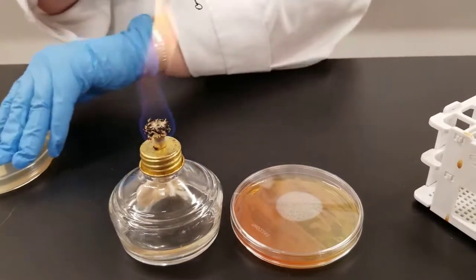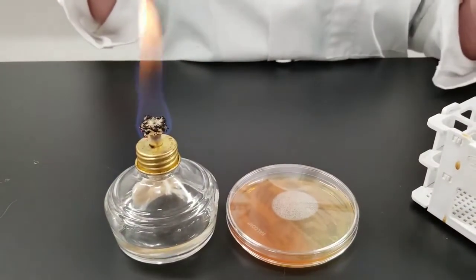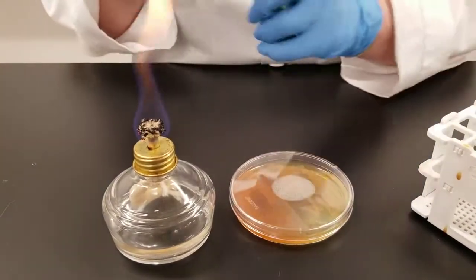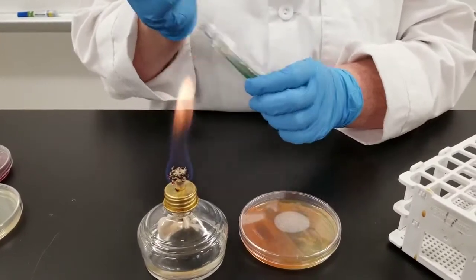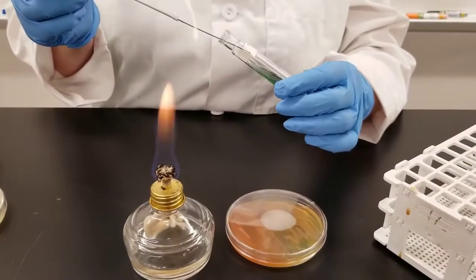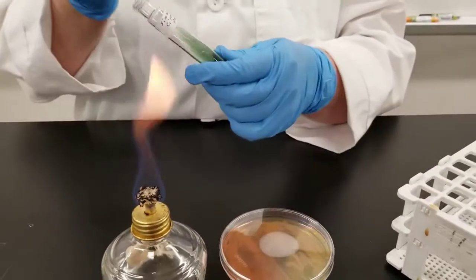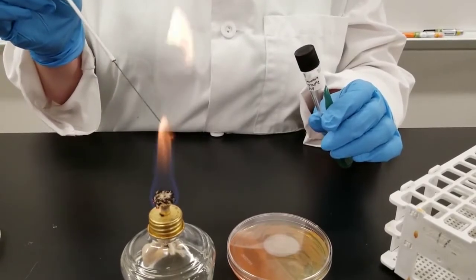Both of these plates have now been inoculated. Now I'm going to inoculate a slant — this is a Simmons citrate slant. I'm going to inoculate that once again from the stock plate. By the way, the bacteria we are using is Pseudomonas aeruginosa. It is a gram-negative organism commonly found in the soil and can also cause various infections in humans. We're going to flame the lip of the test tube to sterilize it, bring our loop down to the bottom, and then just streak up. The idea is that our bacteria will inoculate along the slant of the tube. Flame the lip of the tube again before closing it, and once again flame your loop.